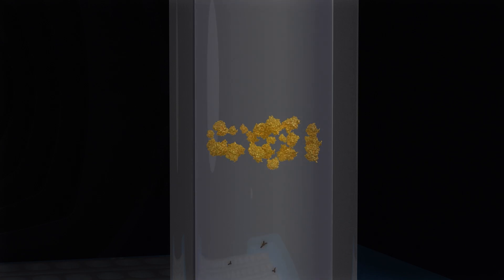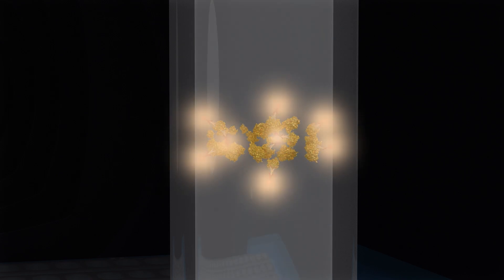For chemiluminescent detection, samples are first incubated with the primary antibody followed by a secondary HRP conjugate and finally chemiluminescent substrate. The chemiluminescent reaction is recorded by a CCD camera in a series of images over time.